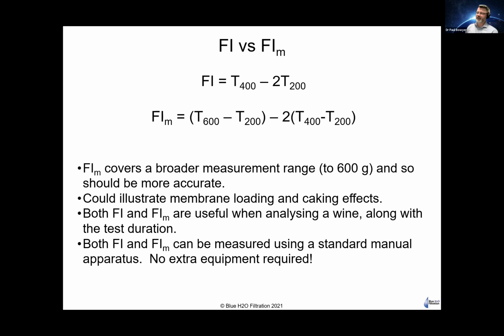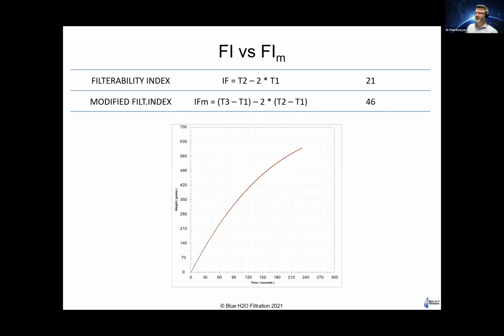The modified goes out to a 600 gram or 600 mil time point and covers a broader range and gives you a slightly different reflection of what you're seeing in terms of membrane effects, caking, colloidal impacts, those sorts of things. It's very easy to do.